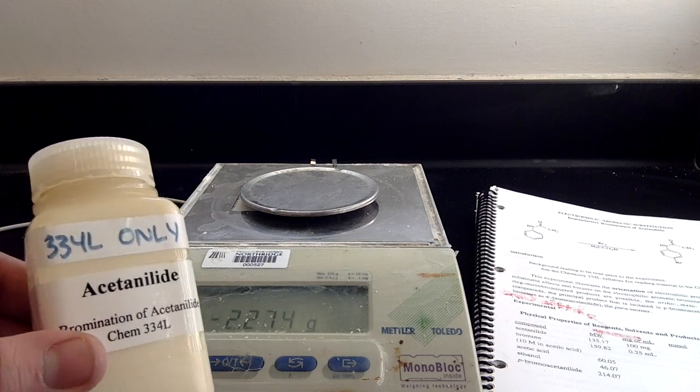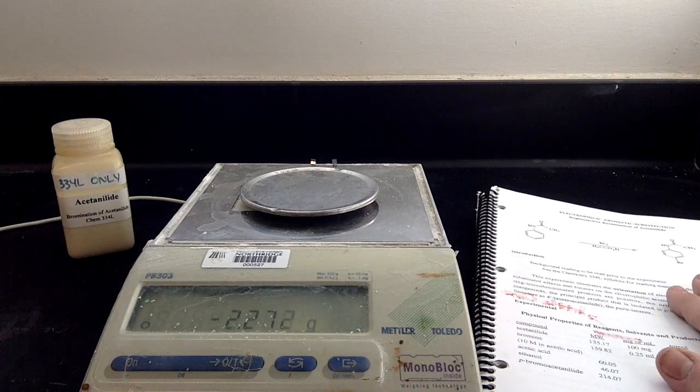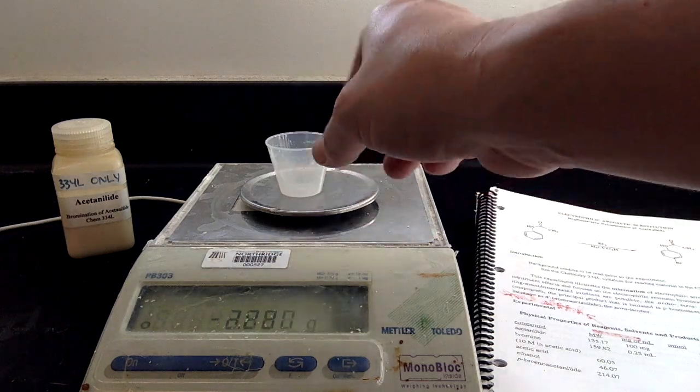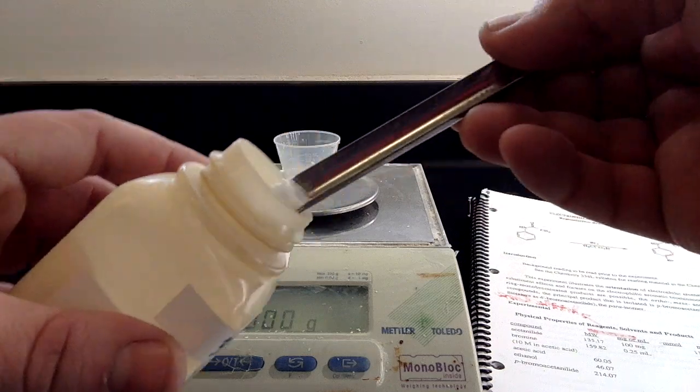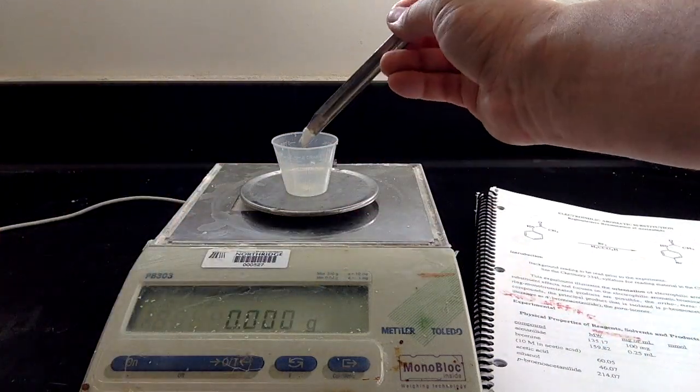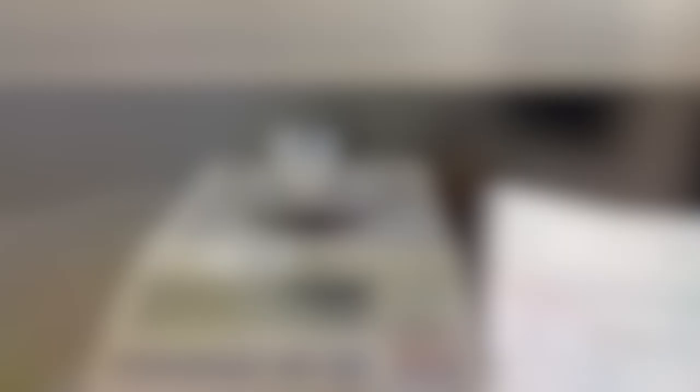Remember when you're measuring the acetanilide to have something to write it down with. The actual amount you take is more important than the amount that tells you to take in the book. Plus or minus 20 milligrams will be good from the 100 you need to take. Let's see what I got, 95, that's great.